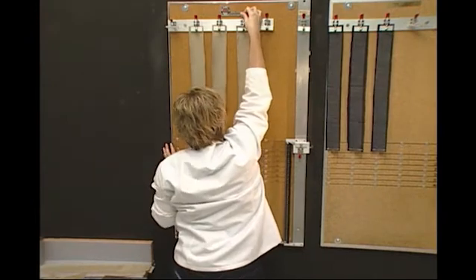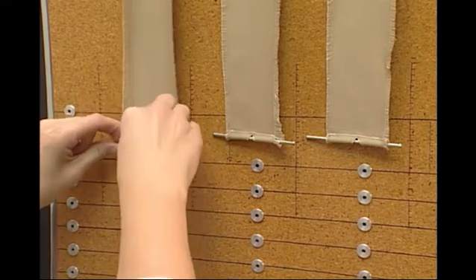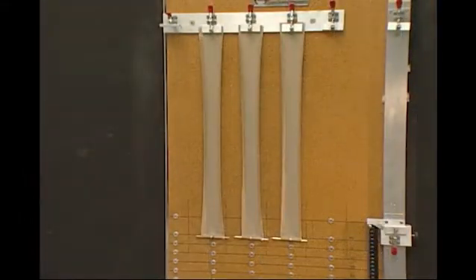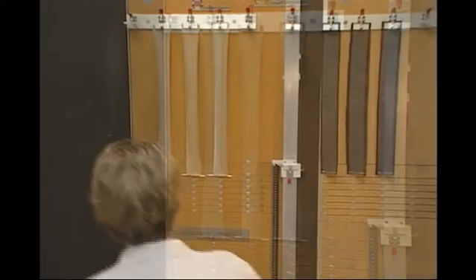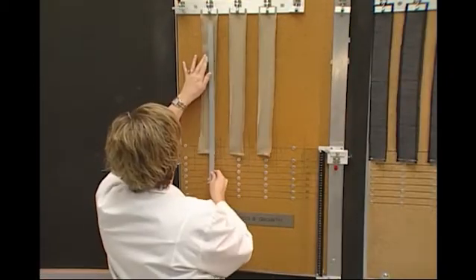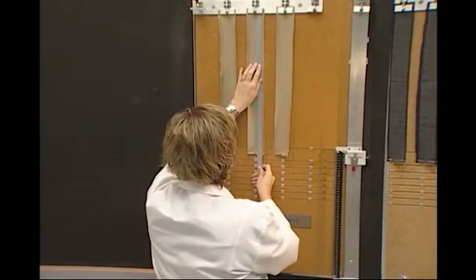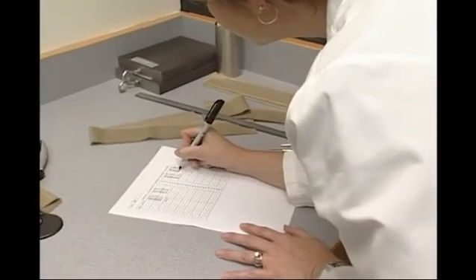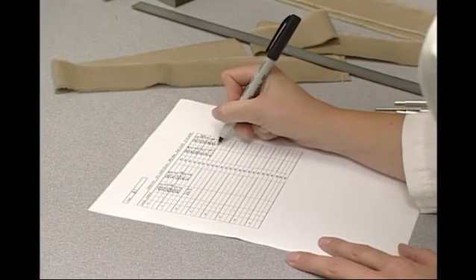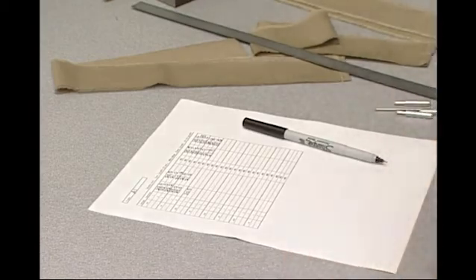With new specimens, mount them into the top clamps of the stretch frame. Pull the specimen out to the 85% stretch distance and secure in place with a pin. Leave the specimen extended for 30 minutes. After 30 minutes, release the specimen and allow it to hang freely. Measure the distance between the clamp and sewn stitch line after 30 seconds, 30 minutes, 1 hour, and 2 hours. From these measurements, growth after extension to an 85% stretch extension can be calculated using the same formula for percent growth as the one used for percent growth after tension.